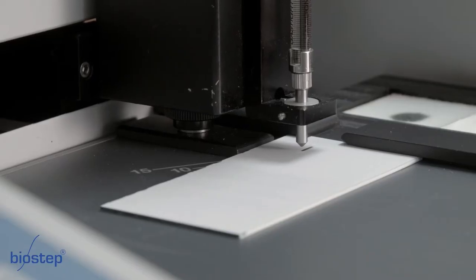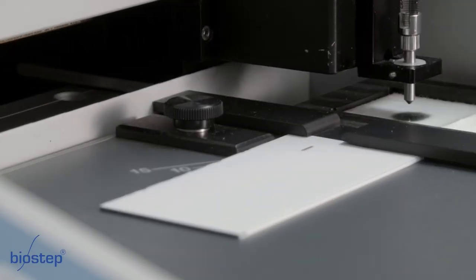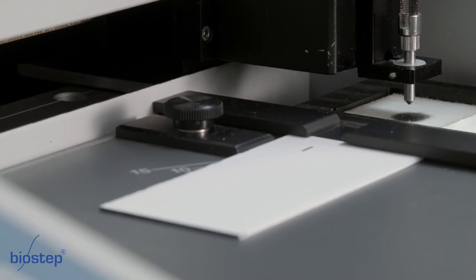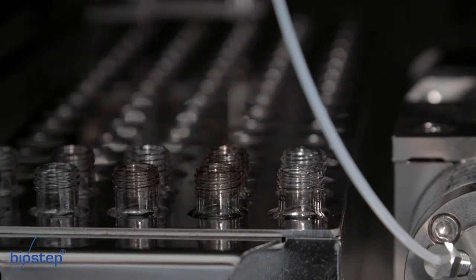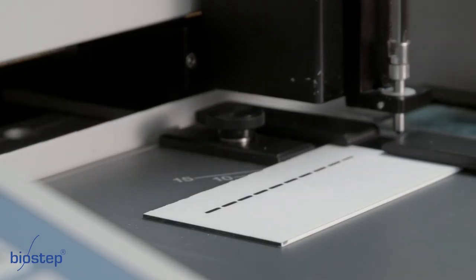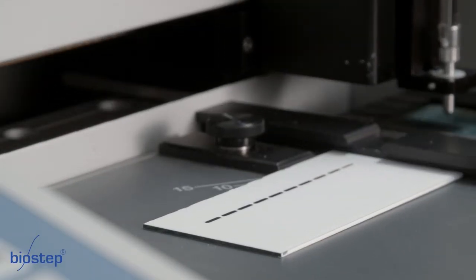A flushing step after the first sample will eject the rest of the sample before a new sample is drawn in. After all samples are applied, the TLC plate will be automatically loosened from the fixing and separation can take place.